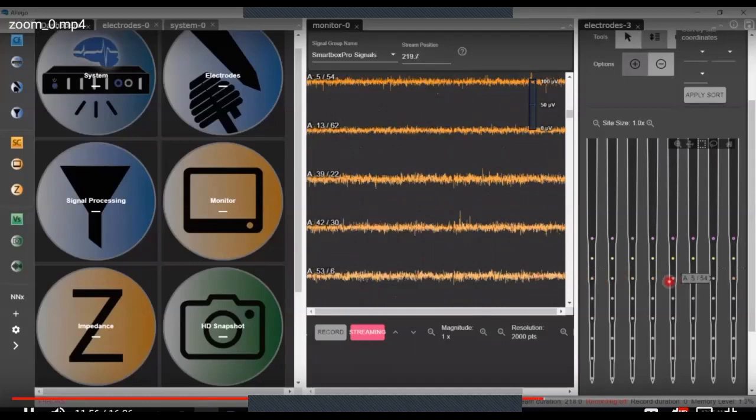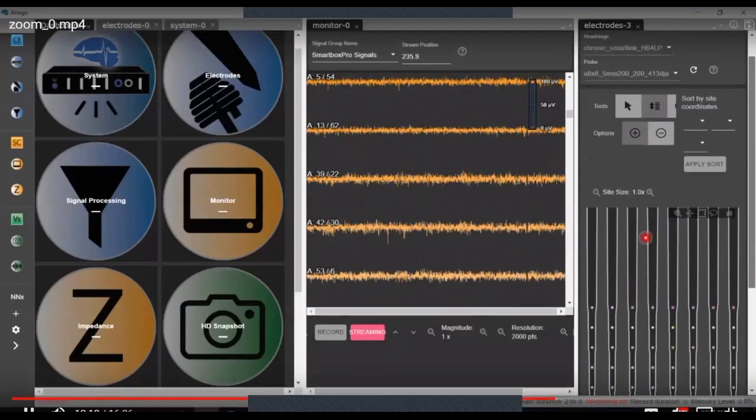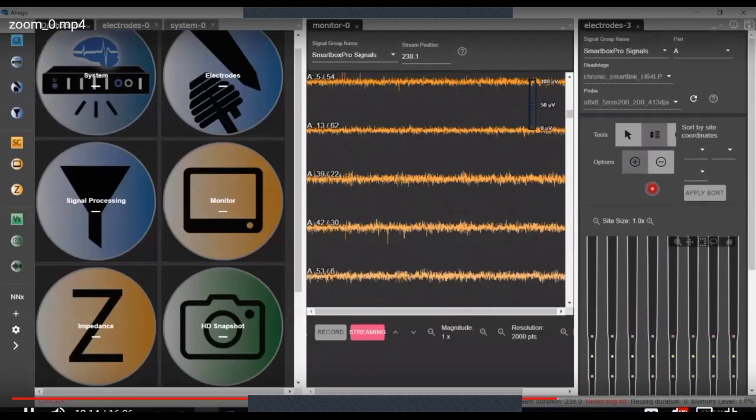If I wanted to say record from a certain level, I could also have done the opposite and say, put each one of these shanks into their own color group as another method of sorting. There are all types of options of ways that you could do this. You could control your recordings and get the best out of them.